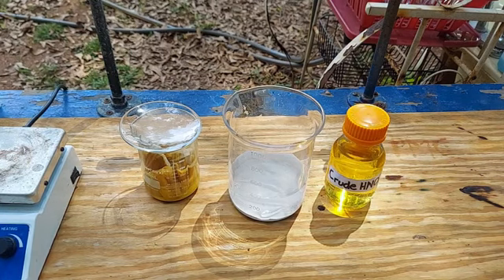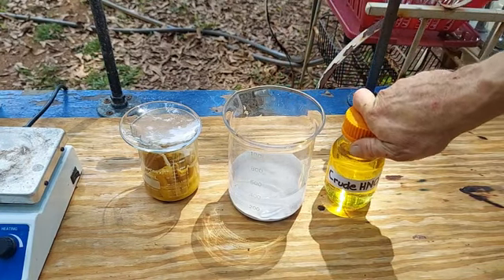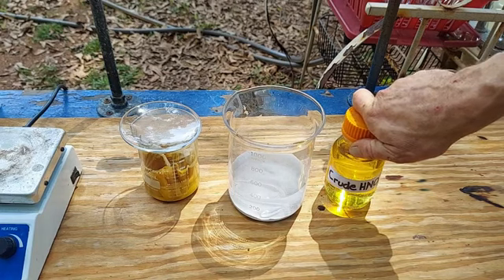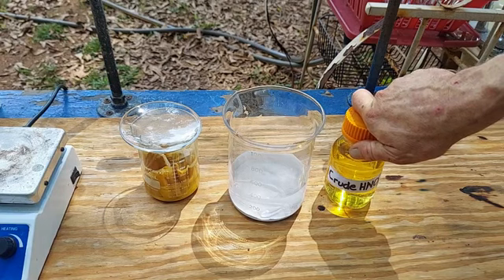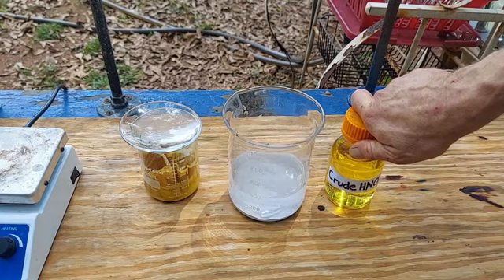It's okay, because in both cases, the plan is now simply to dissolve these in nitric acid and convert the mercury in both of them into solutions of mercuric nitrate. We will then reprecipitate out the oxide again. This should separate out anything else that's remaining. After that, we'll take that oxide and convert it into mercuric chloride. That should crystallize out in nice, big, beautiful crystals. And we can always recrystallize that product from boiling water if we have any concerns about its purity. And that should be fine.